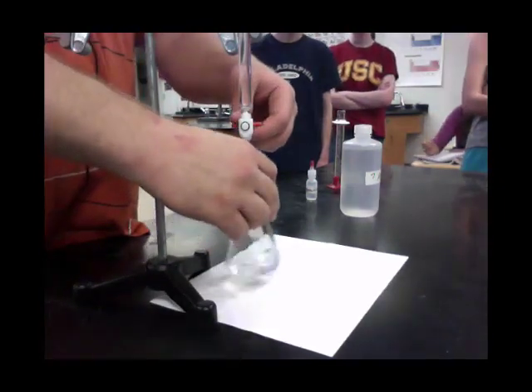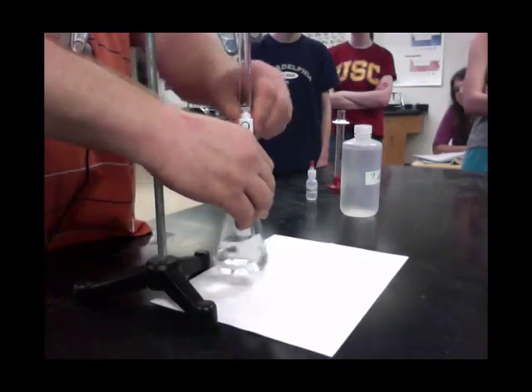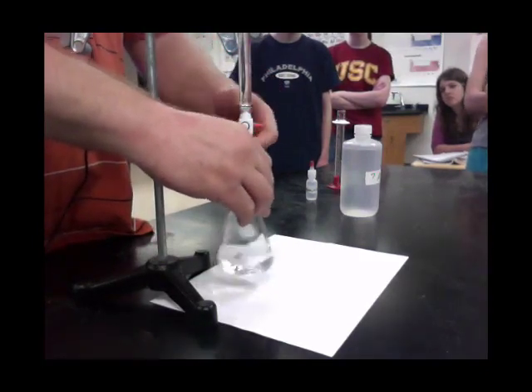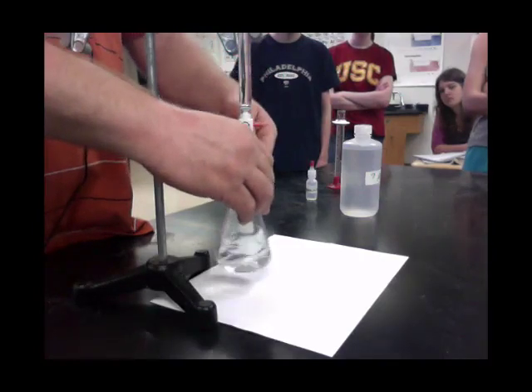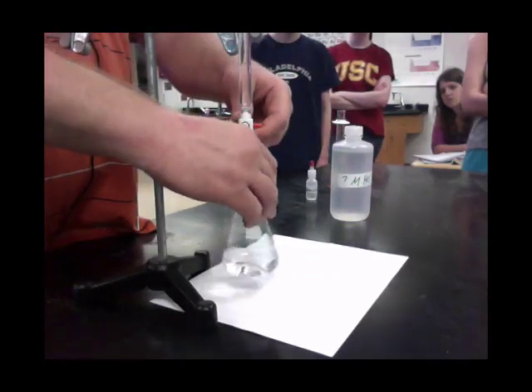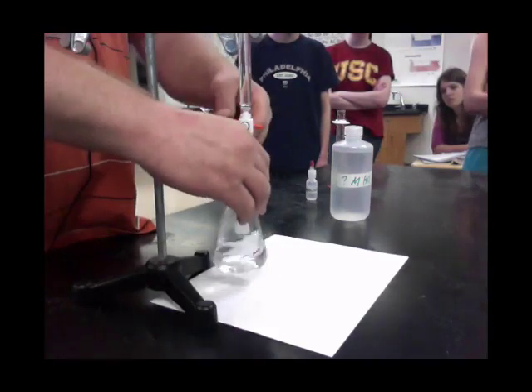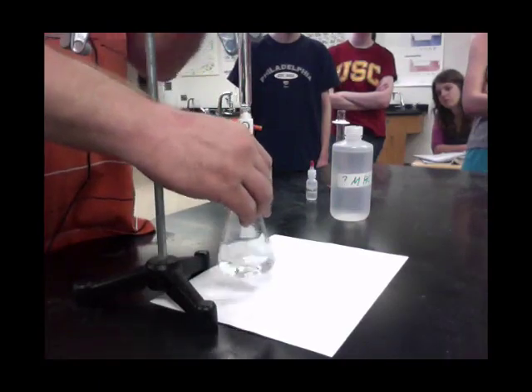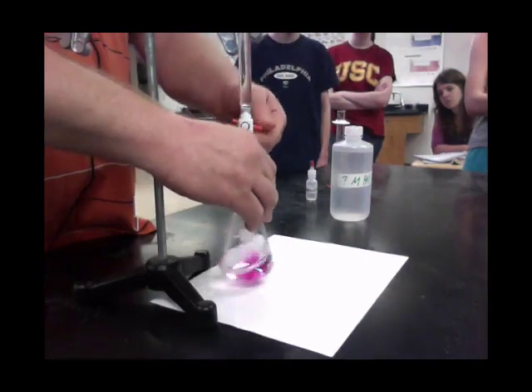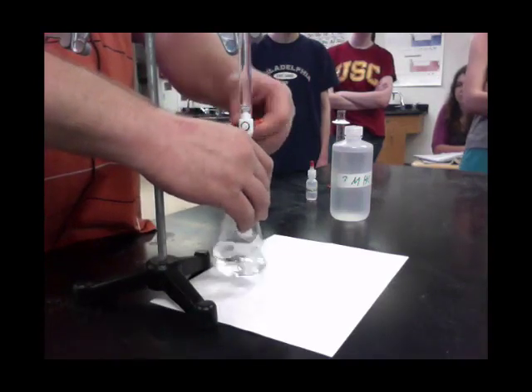If you start off, you want to swirl and open the burette up. You'll notice how you get kind of a pink color, but as you swirl it'll go away. I'm first dispensing a few squirts at a time. I really don't know the concentration of this — I made it up this morning. I'm at 16 milliliters now, so I've dispensed about 12.